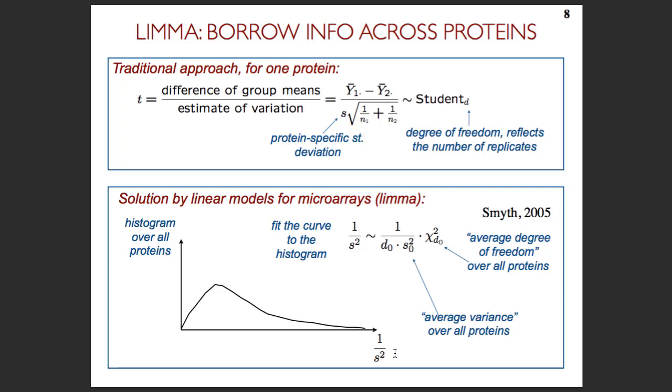So essentially, LIMMA is a very specific part of it. You can add it methodologically to MSstats. And TMT does it because we noticed that in TMT, the number of replicate runs tends to be small for the moment, so we try to help with that. In the base MSstats, we decided not to do this because we would rather advocate that at this point people use more than 3 replicates per group. But maybe, I don't know, we'll see what Mina and Ting say. Maybe we will end up adding this if people really, really insist.